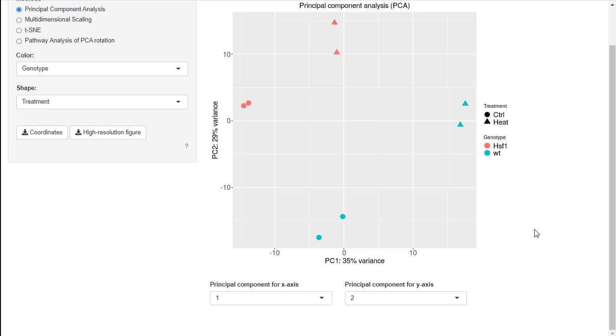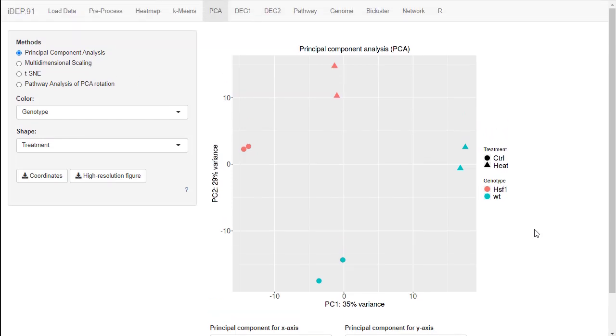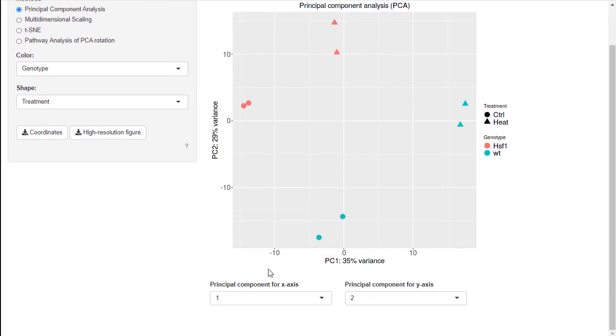Now, principal component analysis is a dimension reduction method, so the component itself, strictly speaking, doesn't have any meaning. It's just a rotation of axes in high dimensional space. But for each component, for example PC1, each sample has a projection, or a loading, on it, so each sample will have a number. Because samples can be divided into groups by these factors, we can look at whether this principal component is correlated with any factor.